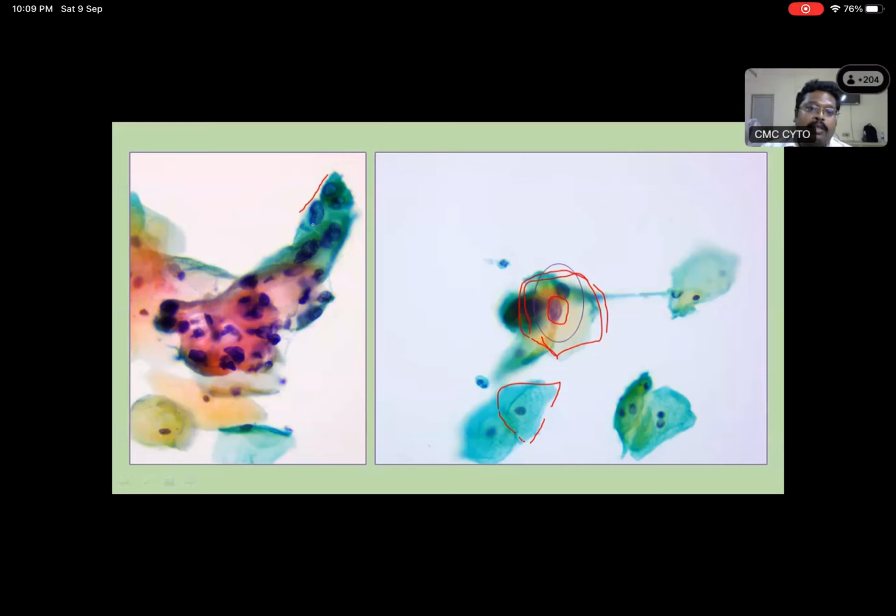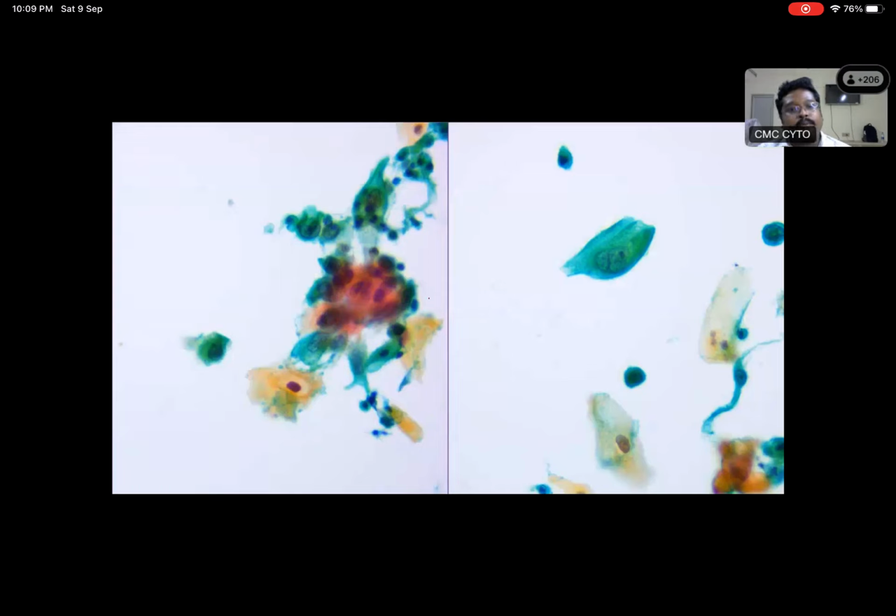And you can see this kind of notching in this nucleus, some nuclear membrane irregularity here. Again, you can see this notch in the membrane, right? Again here, in this cell, the nucleus is enlarged. Similarly here, compared to this cell, there is nuclear enlargement and binucleation. So there is binucleation or probably an indentation, not sure.